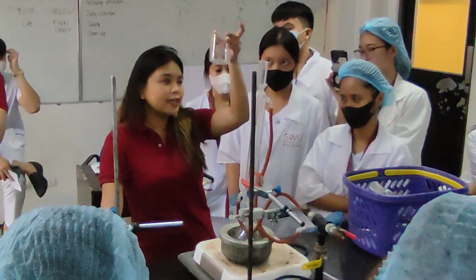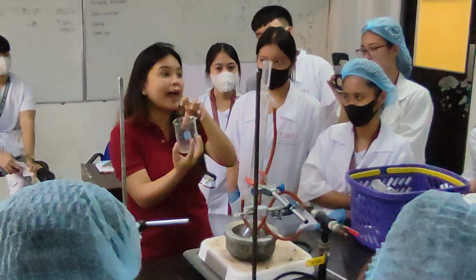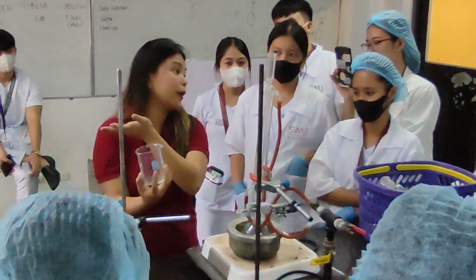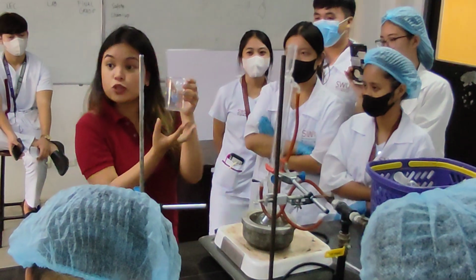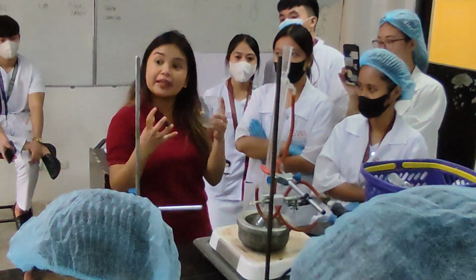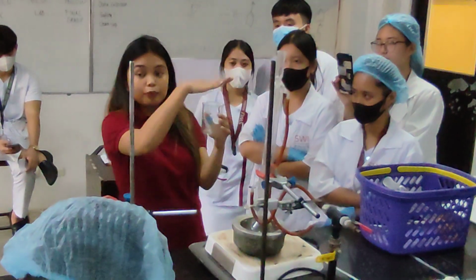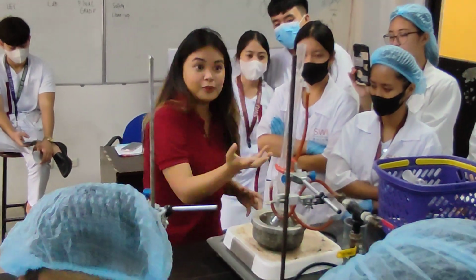Now, if you heat this solution, solute and solvent, what will happen? The solvent, your volatile substance, will what? Heat. Evaporate. Now, what will be left here is your solute. And you don't want that to happen because you want a complete reaction. You need to see the reaction between your solute and solvent, especially in organic substances. So you want to keep your solvent. So reflux heating was invented.